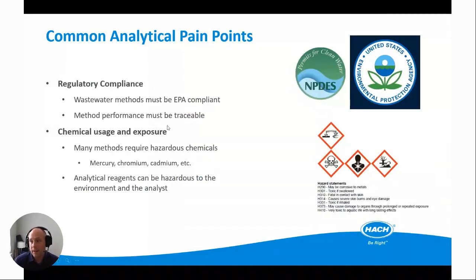So, other frequent common analytical pain points not associated with the methodology itself is regulatory compliance. Our wastewater methods are usually part of a permit, like I mentioned earlier, an NPDES permit, and those are going to be used to determine compliance. And so those have to be approved by the local regulator, whether that's the state or the federal EPA. The regulator is always very specific about what kind of method can be used, and obviously they want a method that will work for the analyte in the specific matrix. So that's a frequent concern.